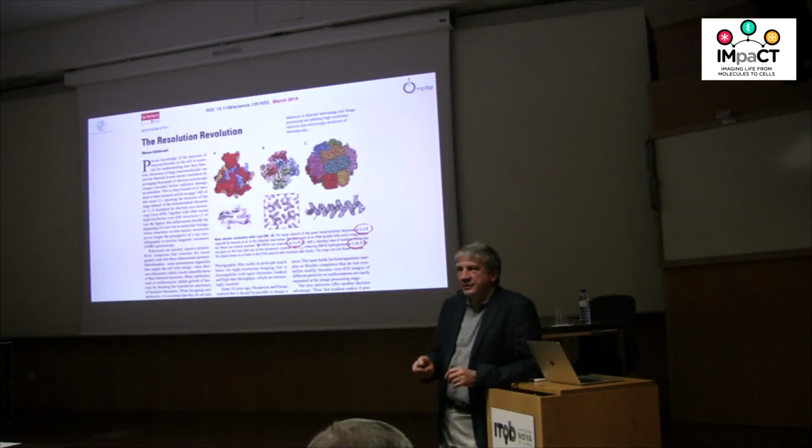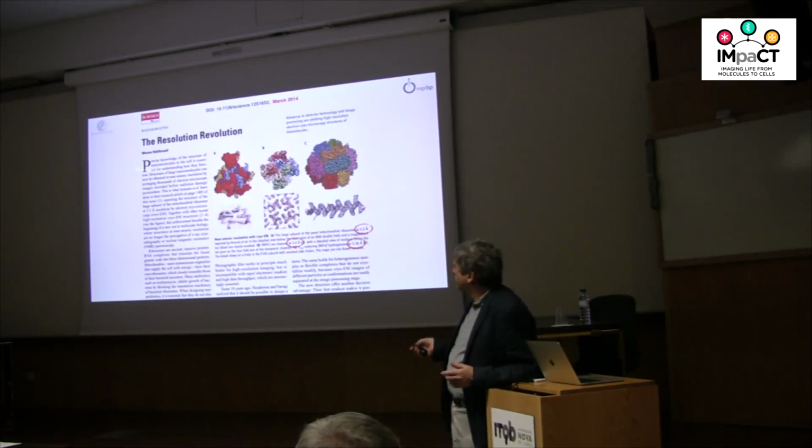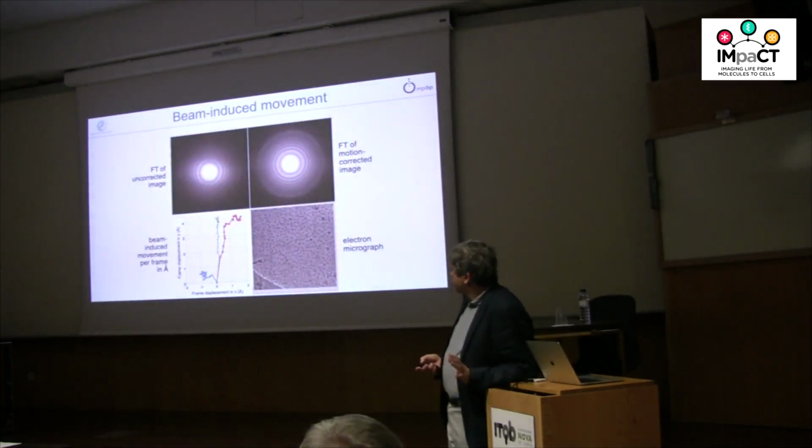And equally important is a new set of software algorithms. If you work in this field, you probably all know them, and they have been a massive contribution to maximum likelihood image processing, to really get the most out of these images which you can record with these new cameras. So together, they have really brought about this revolution. And this is to give you a bit of a taste of this.